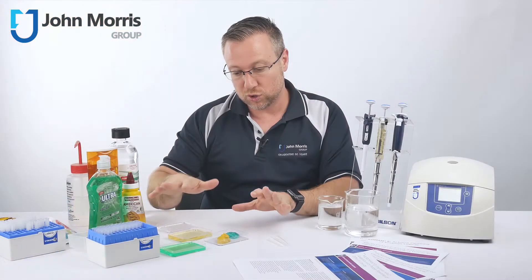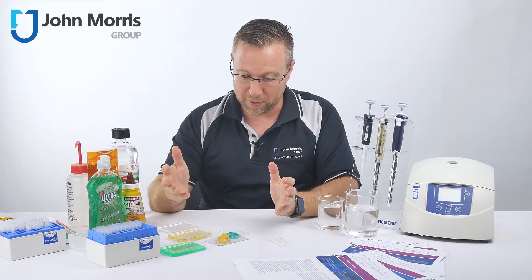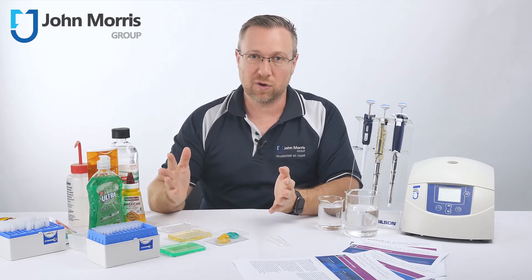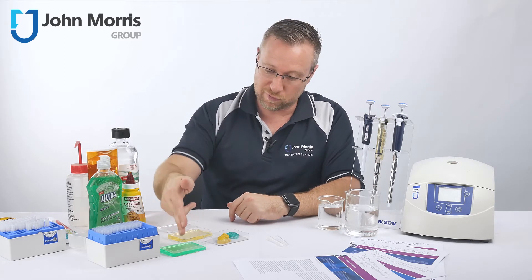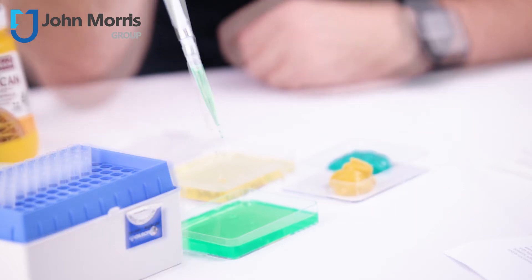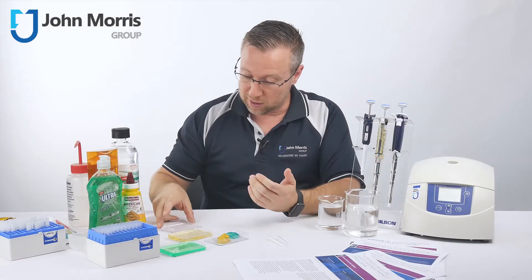These are different liquids with very different challenges. Viscous liquids are incredibly hard to suck up with a normal pipette, and some people try cutting the end off their tip — but that's not a great solution, as it's very rare you get accurate or repeatable dispensing. With soaps, they tend to foam: they're viscous to start with, and when drawn up they'll foam slightly, meaning they're less likely to stay in the pipette and more likely to come out the other side.